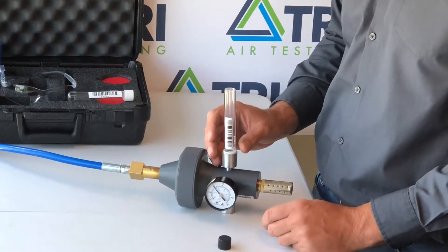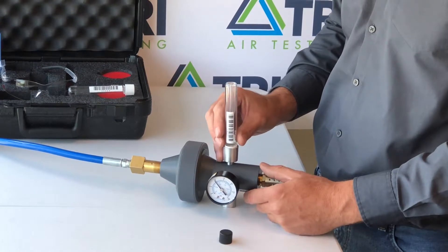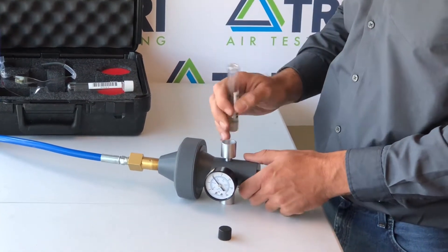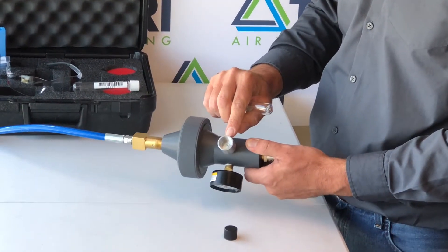Allow the sample to collect for one minute and then remove the bottle by pulling straight up, ensuring that you do not twist. Twisting will damage the pins inside of your fitting.